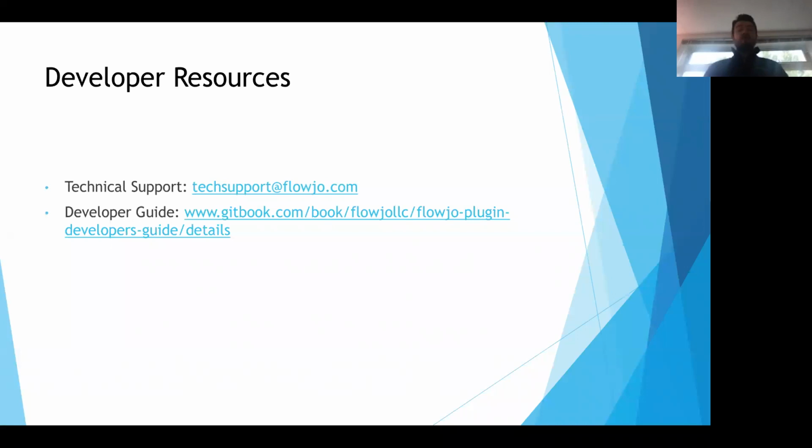So that's really handy. If you wanted to try and do this yourself, we highly recommend the following developer guide or documentation, which describes in detail how to create a plugin for FlowJo. Again, these are plugins that reach out to R, although you could actually, in theory, build plugins that reach out to Python or other external third-party software.